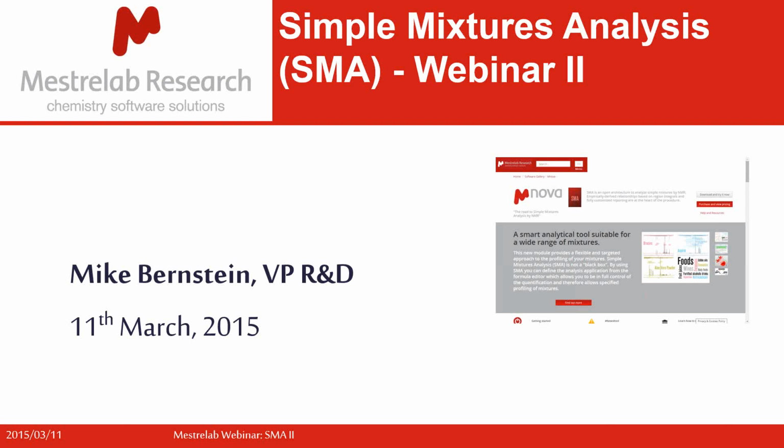So let me start by welcoming you to the second webinar on simple mixtures analysis. I spoke to you about 2 weeks ago in a broader sense, and I'll be reviewing some of that material before I delve into the detail that constitutes the second webinar.